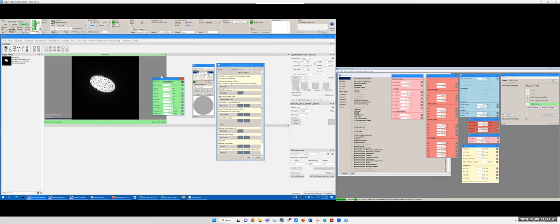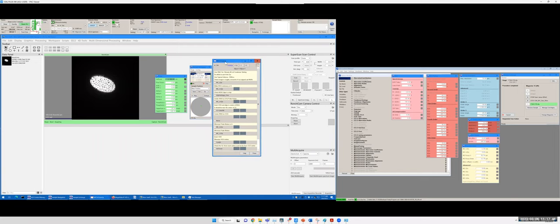Okay, now we are talking about beam alignment. If I look at this aperture, it's kind of squeezed, right? So you can easily tell, okay, this aperture is not round. Should it be round? No, actually this is a monochromator aperture. It should not be perfectly round. It should be under a certain condition.